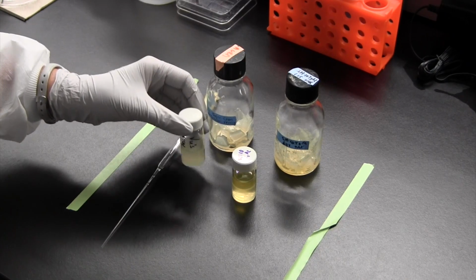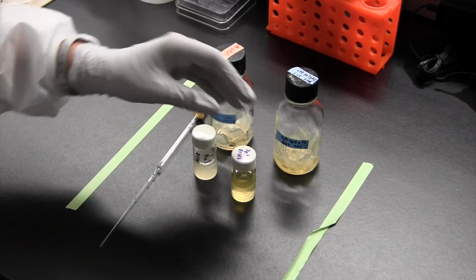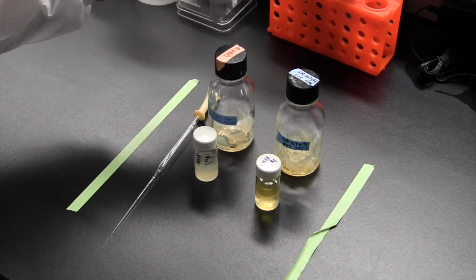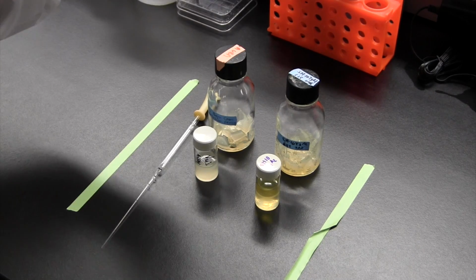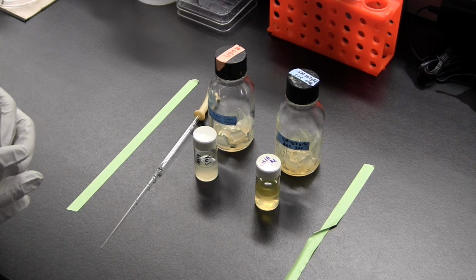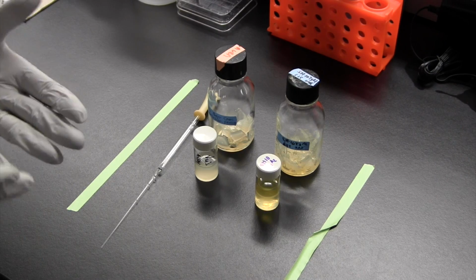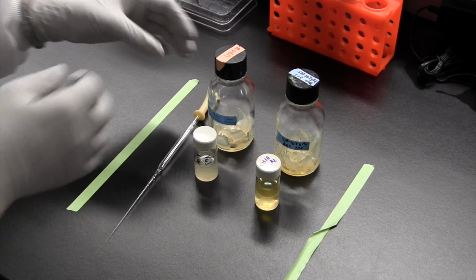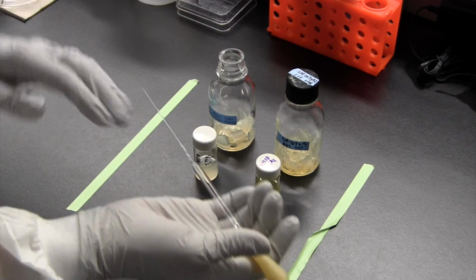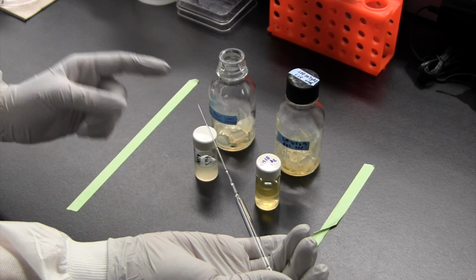These are definitely the easiest thing to use with the chemical extraction. So if you have access to the 20 mL scintillation vials, we highly recommend using these for this portion of the chemical extraction. But you can also use glass test tubes. Some instructors have used glass petri dishes. They present their own inherent challenges, but essentially any vessel you have that's glass will work if you can make it work. So all that the students have to do at this point is, again, use a glass pipette, and whatever your preference, long or short, the long ones do have a tendency to break more readily.